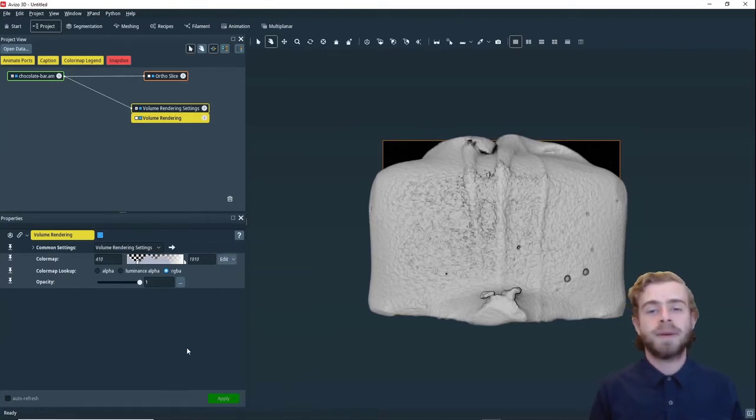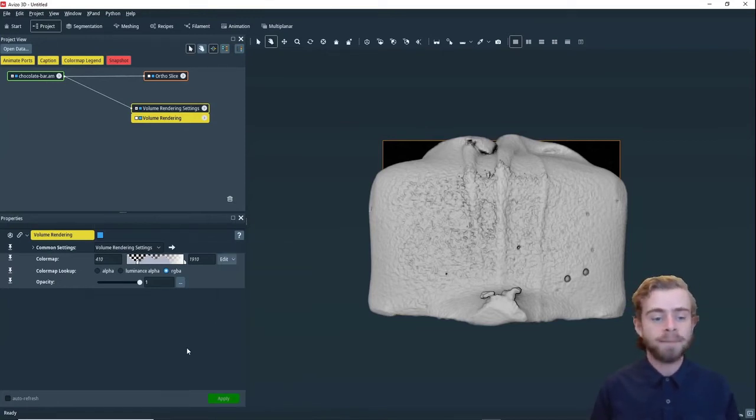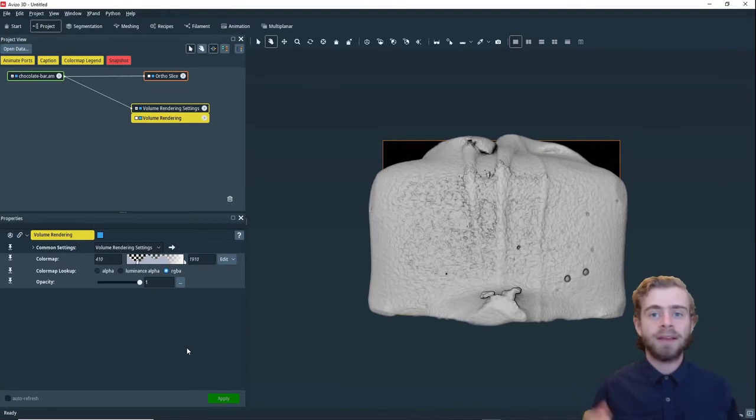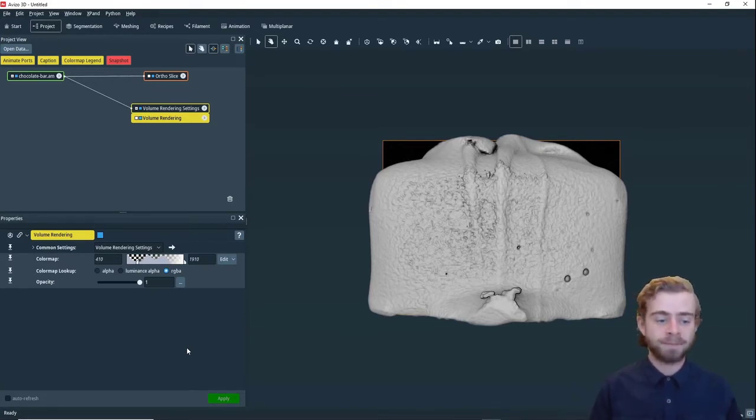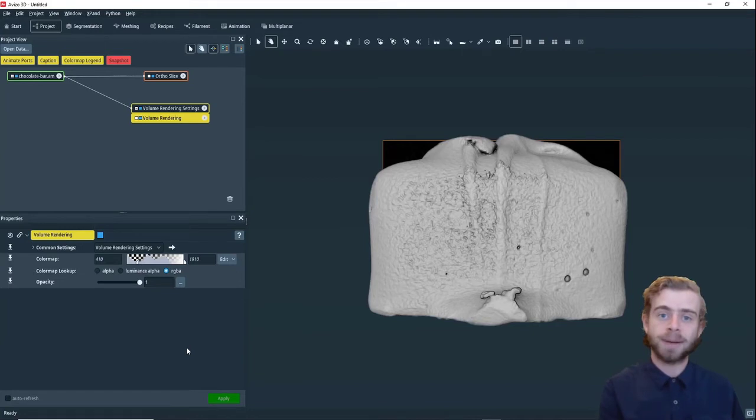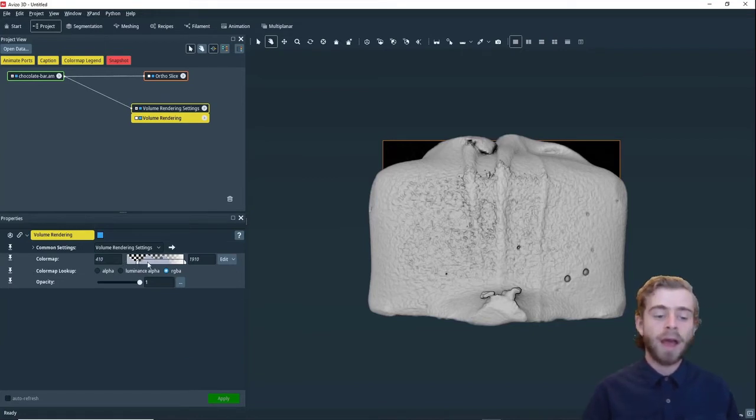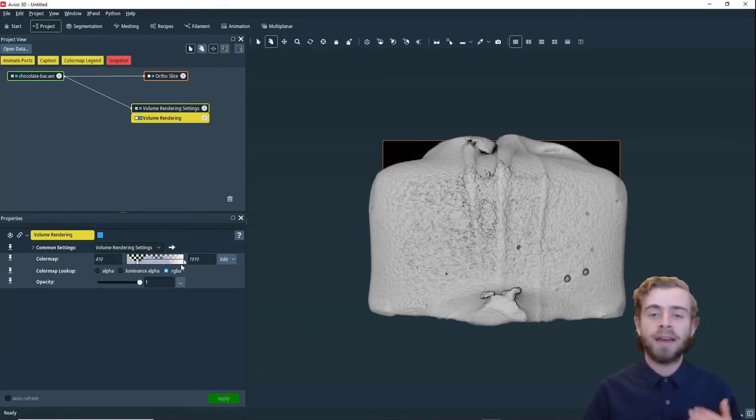And one thing that's special about the Valoran white color map is that it doesn't have a constant transparency. So at the bottom of the color map, it's fully transparent. And at the top of the color map, it's fully opaque.